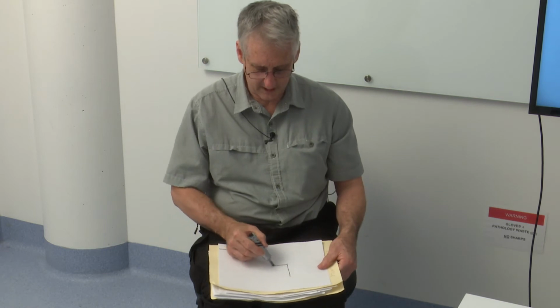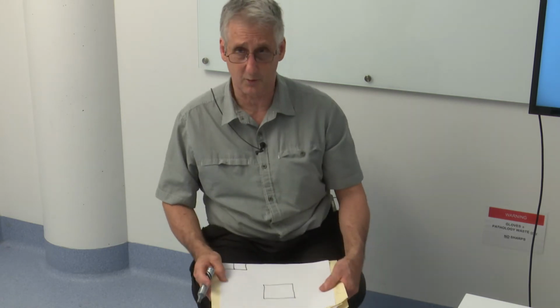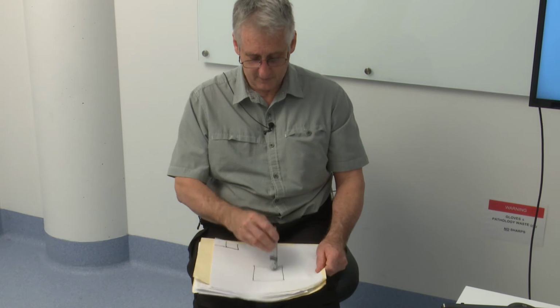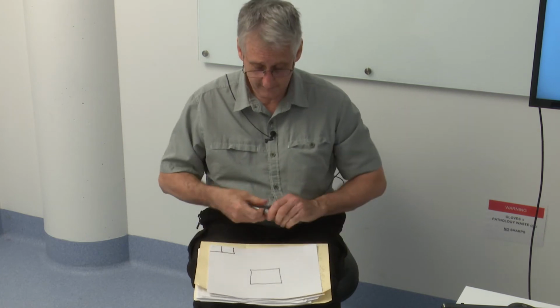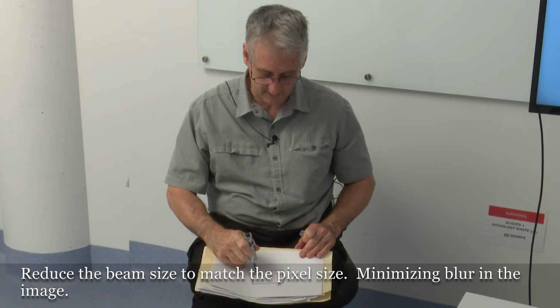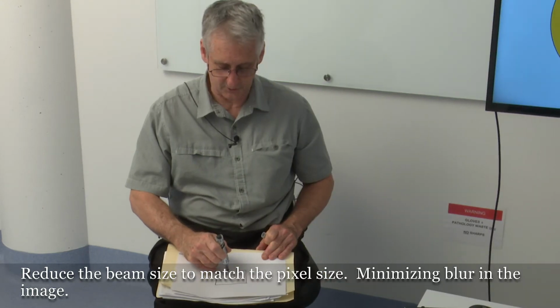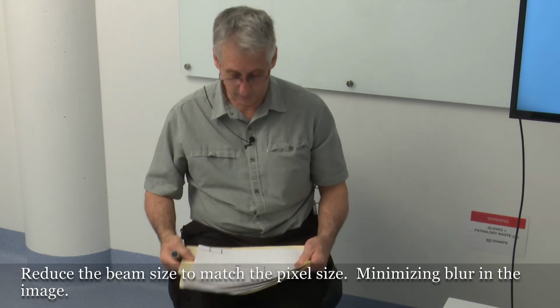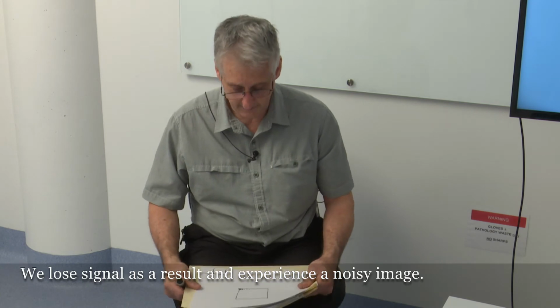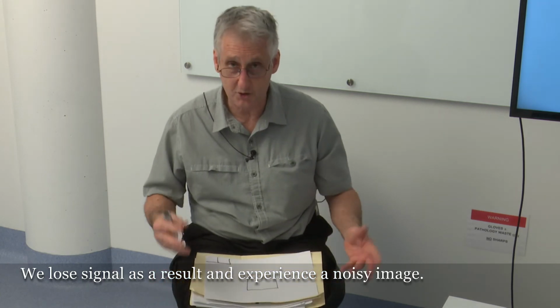If we decide we are going to scan this area and fill the SEM screen up with whatever is there, if I use my beam the same size, what's going to happen with the same number of pixels is I'm going to have way too large a beam for the size of the pixels, which really should be only that size. And it's fairly obvious that in order to avoid that blurring, we have to reduce the size of that beam so that it's now appropriate for the size of those pixels. That will reduce that blurring, but we will lose signal. Our signal to noise ratio will be poorer, and basically we may end up with quite a noisy image on the screen, a speckle appearing in our scanning electron microscope image.